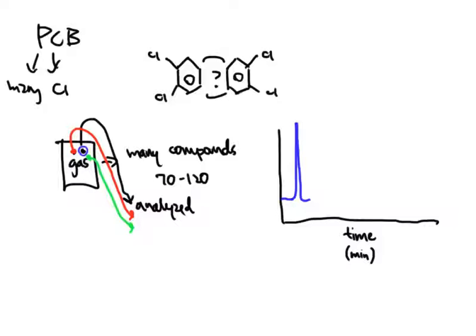All right, we call that a peak. That peak represents one particular component. And then if your sample only has one component, that's the only one that you'll see. However, we also see that there's multiple things inside of our sample. So sooner or later, my red portion will come off, which represents my second component. And when that comes off, the instrument will see it. And then it will slowly come back off as there are less and less of it, and it will come back down to the baseline. So that represents a second component that the instrument has seen.